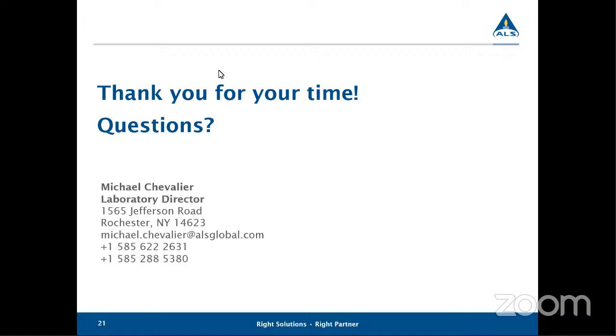Is the monitoring well purged before deploying the passive diffusion sampler? No. The passive diffusion sampler can just be deployed as is. Do you have a recommendation regarding when to collect water quality, physical measurements, pH, DO, temp? That I don't have a recommendation on, unfortunately. That's not something that I'm as familiar with, as far as when those should be collected in the field.